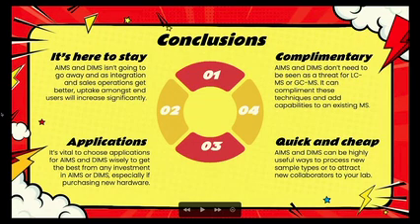that. The techniques are complementary. They don't threaten LC or GCMS. They can add to the repertoire of what you can do in the lab. And as I say, if you screen and then find the samples that you're most concerned about and most interested in and focus on those with your LC or GCMS, I think that's where AIMS and DIMS complement LC or GC very, very well.